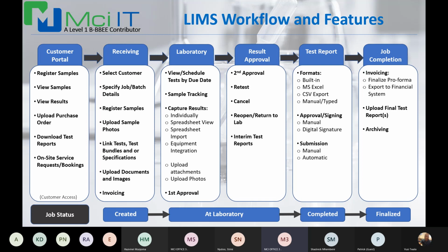Some of your more expensive machinery, such as analyzers, have their own software program with their own interface that you can't interface with, other than using the export files that they produce and then importing them into the system. So different instruments, different protocols, different approaches, but it's also something that we provide for. That is in terms of equipment integration and barcode labeling, scanning and printing.